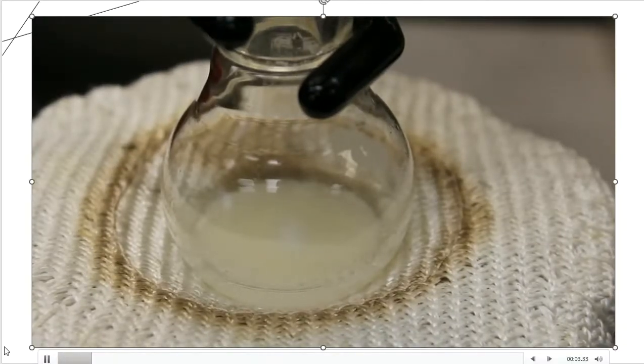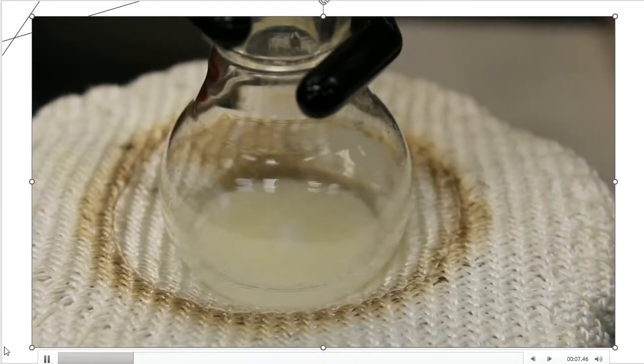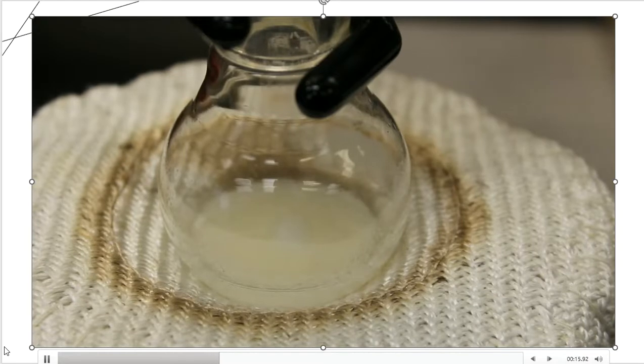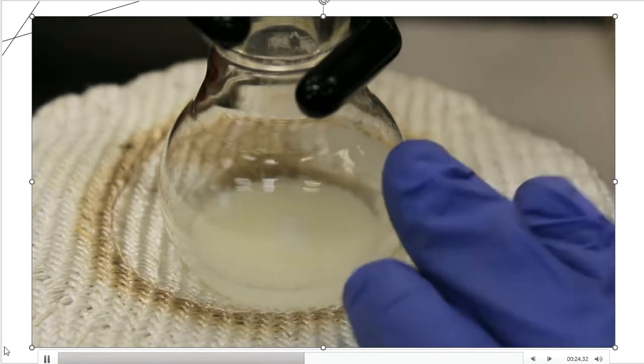So I've finished dripping the acetic anhydride into the flask below. You can see it's still kind of this milky, soupy, crystally. Not all of the aluminum chloride has dissolved. And now it tells me to turn on the heat. And I have. I've turned the heat on using the Variac that's to my left. And we're starting to heat this up a little bit hotter.